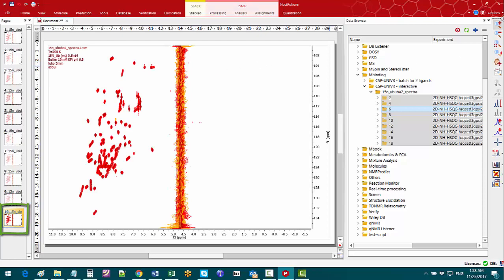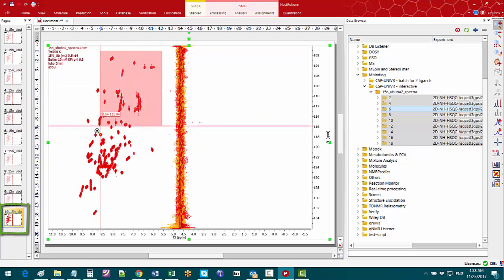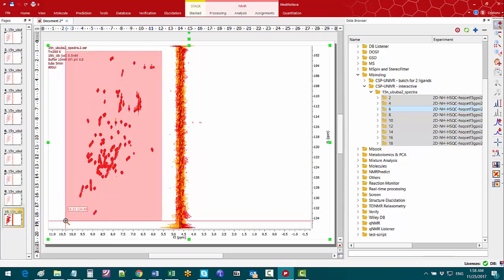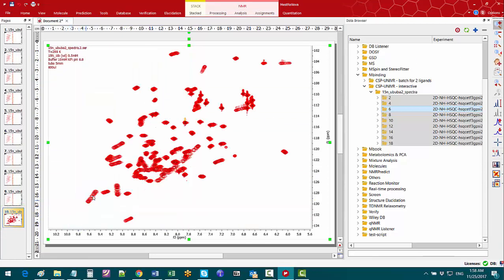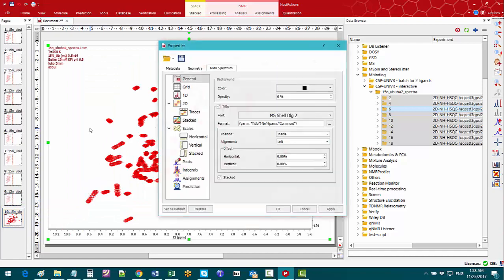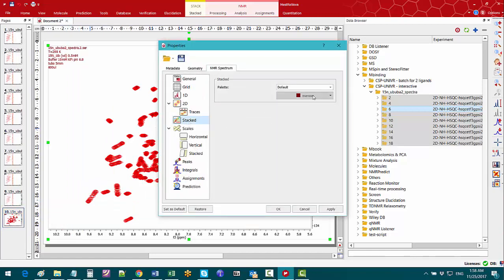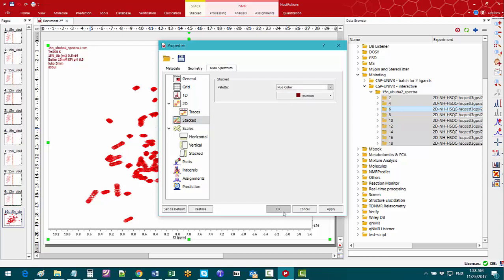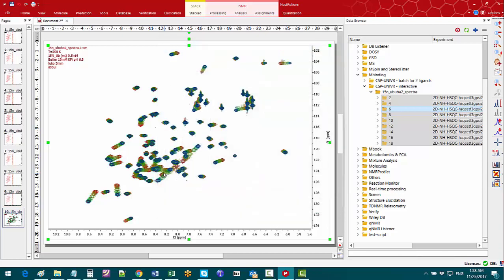Zoom in to the fingerprint region, double click the display and properties window. On the stacked tab we can change the palette colour to hue colour so that the contours from different spectra are coloured in different ways.